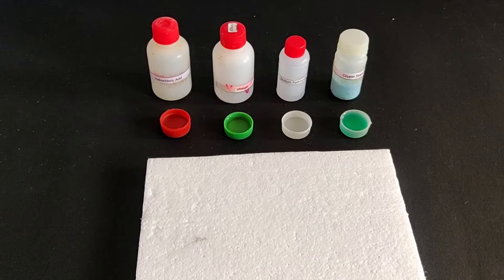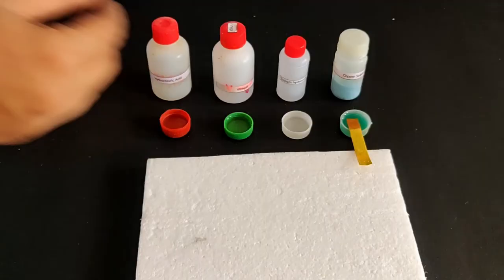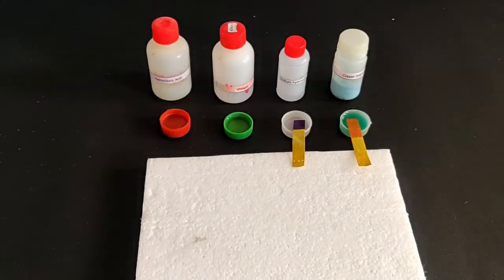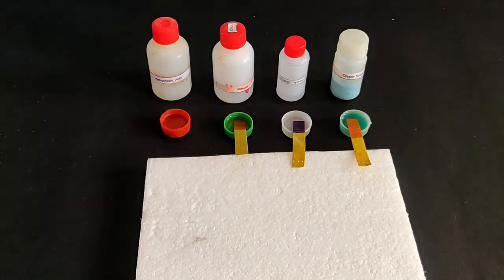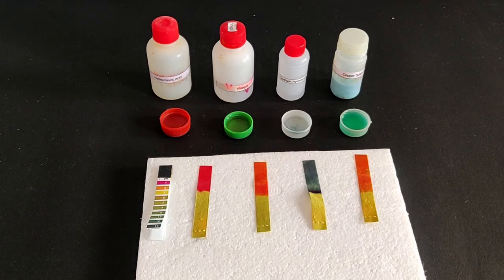Take a sample of the test solutions in the containers. Dip the pH paper in each of the test solutions and observe if there is any change in the colour of the pH paper. Determine the pH value by comparing it to the legend given on the packaging of the pH paper. Note that half a pH paper leaf can also be used for economical use of pH leaves.